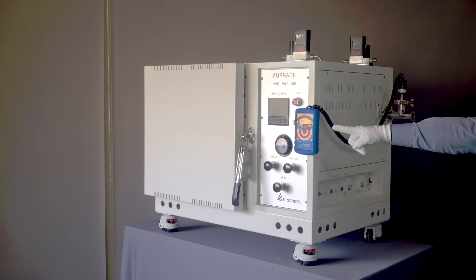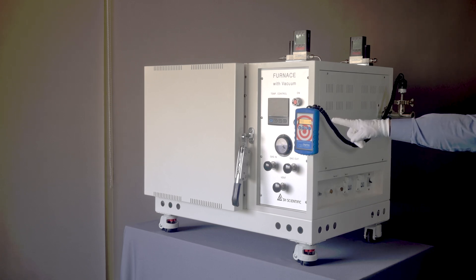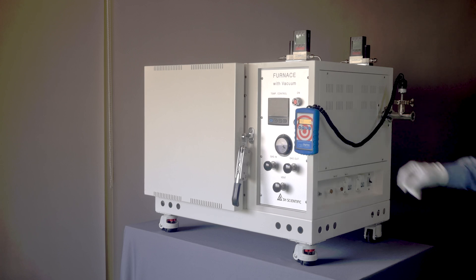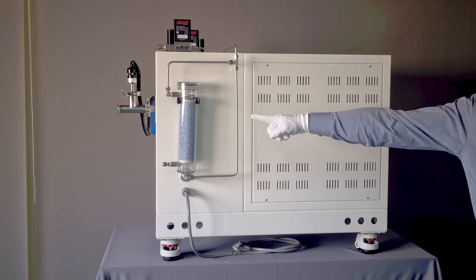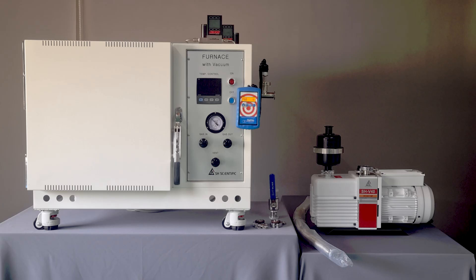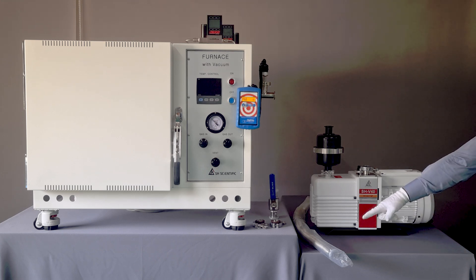There's also a precision digital vacuum meter, which gives you real-time vacuum readings in Torr, millibar, kilopascal, inches of mercury, pound force per square inch, and so forth. Additionally, there's an air and gas drying unit, which removes moisture from gases as they flow in. And finally, we come to the vacuum pump, which uses a stainless steel bellows hose.